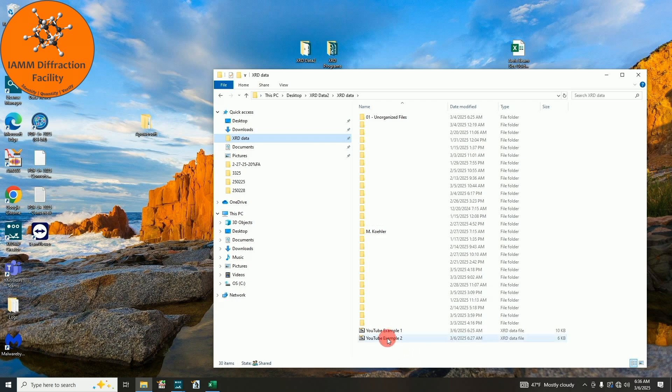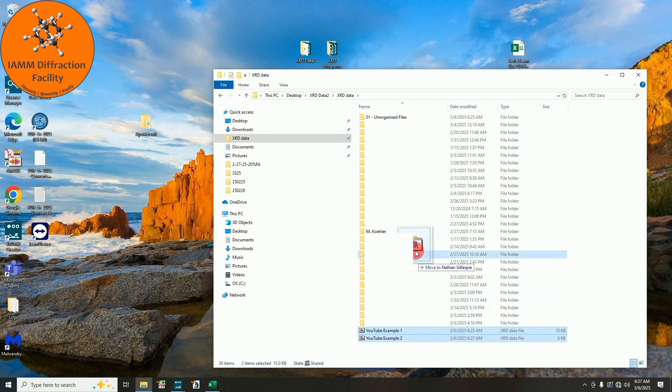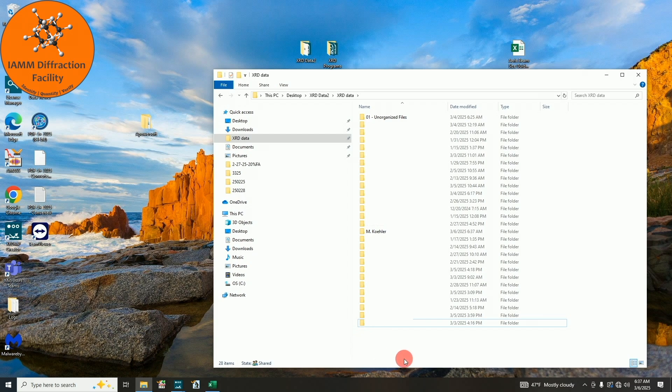Down here at the bottom, you see the two samples that we just collected. I will select both of those and drag them up into my folder. Every morning, I check the ARIS and if there are any files left on there, I copy them over here.